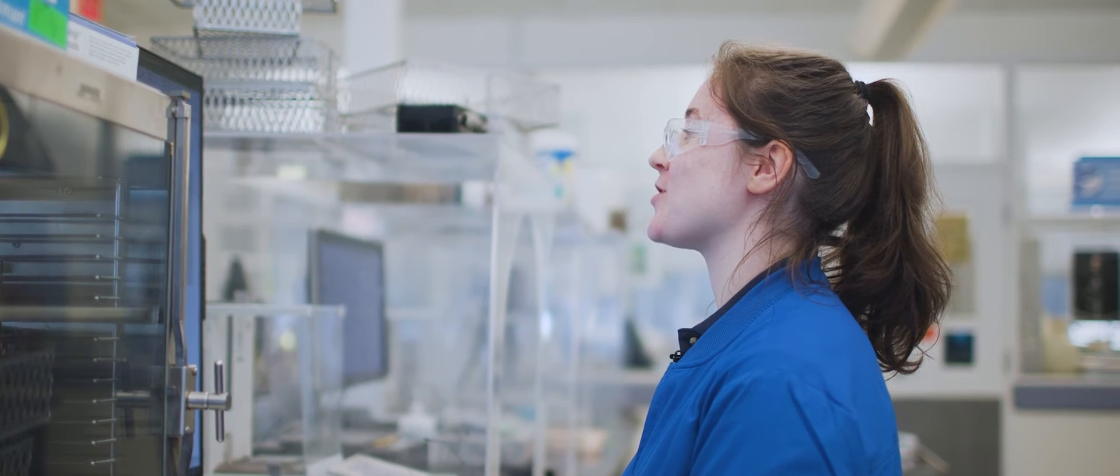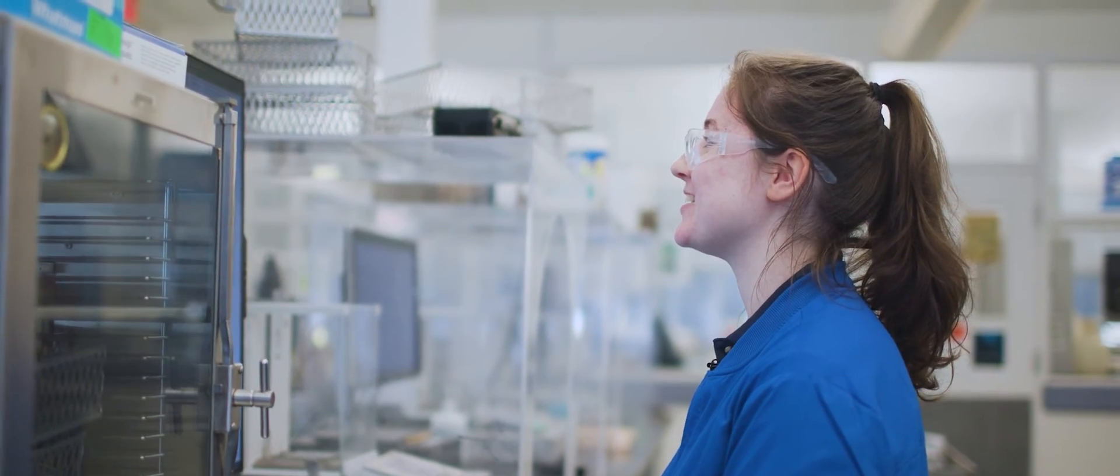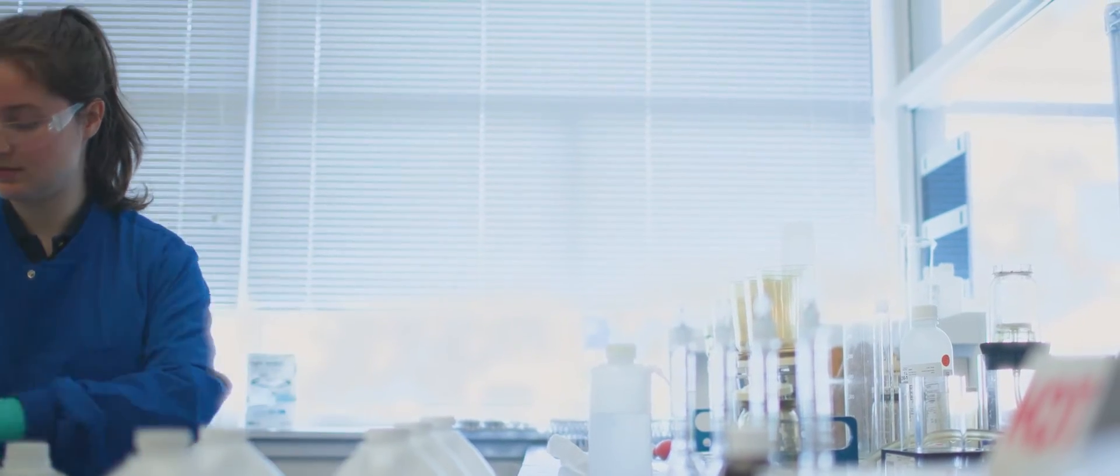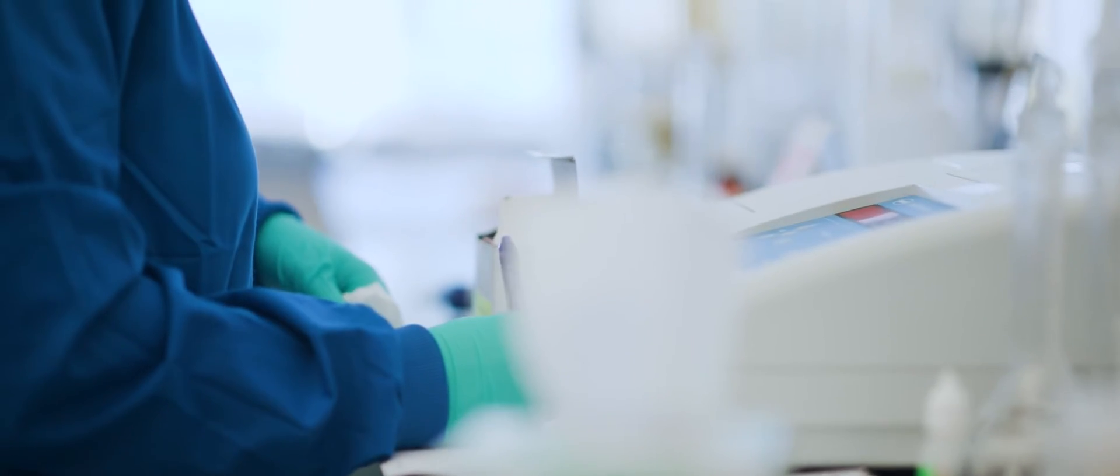There's always something to do. We're always on the go. It's very busy all day. Busy analyzing samples, water and wastewater, a critical component to ensuring our One Water mission.